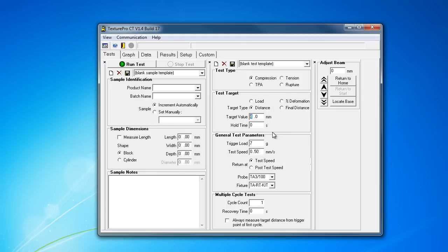Per usual, the instrument does a little booting up noise. The software doesn't add nearly as much functionality as one would hope. You're still faced with the issues that there isn't any form of calibration for the machine.